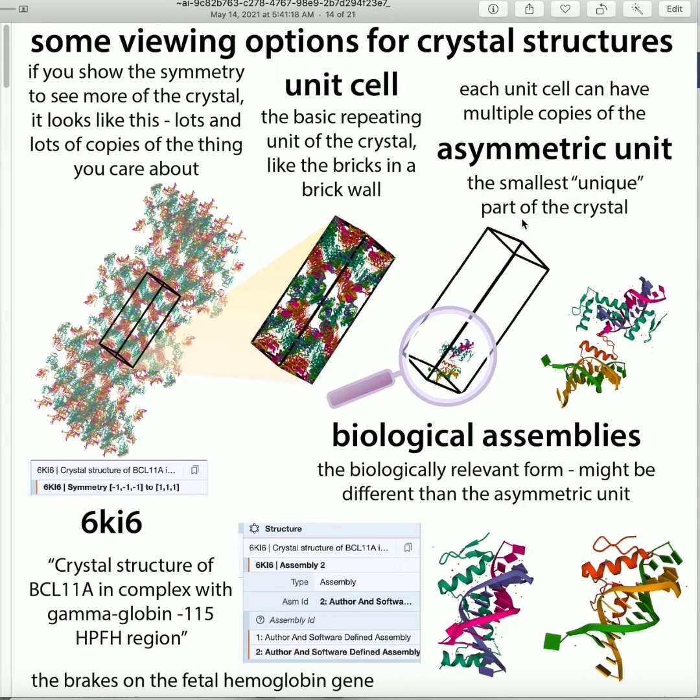And so what we were looking at when we were back at the PDB at that point, we were looking at one of these asymmetric units. So this is one of these biological assemblies, which is one of the biologically relevant forms.